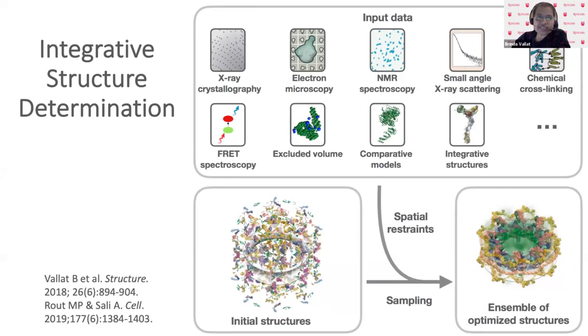Integrative modeling involves combining data from multiple experimental methods such as X-ray, NMR, EM, small angle scattering, cross-linking, mass spectrometry, Förster resonance energy transfer, electron paramagnetic resonance spectroscopy, etc. The experimental data are gathered and converted to spatial restraints and combined with known starting structures of molecular components using computational modeling algorithms to build the structures of complex macromolecular assemblies.